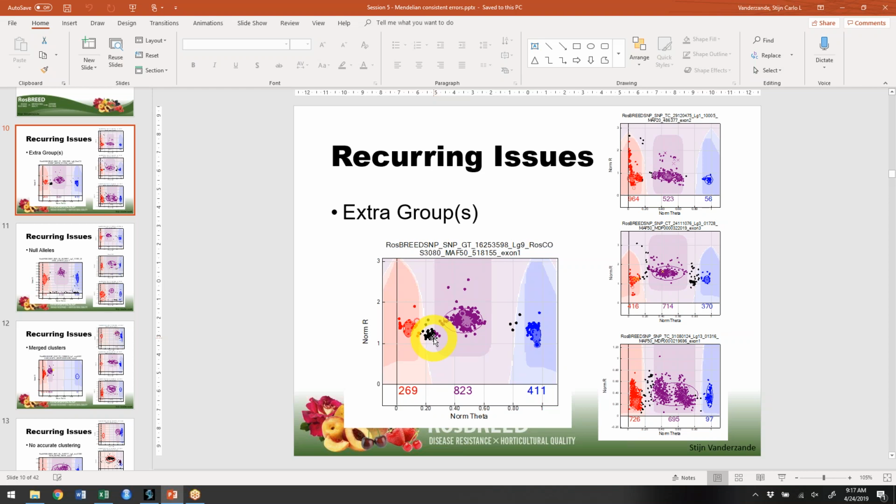And as I've said before, families or individuals with pedigree information are the key to solving all of this and figuring out what this is. So what I would do here is select these individuals in Genome Studio and see what these individuals are.